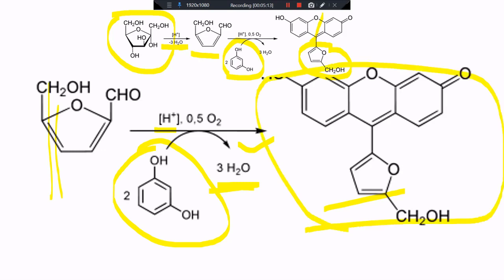This furfural derivative reacts with 2 molecules of resorcinol in the presence of acid when heated, and gives the cherry red complex. The presence of this color is a positive indication.